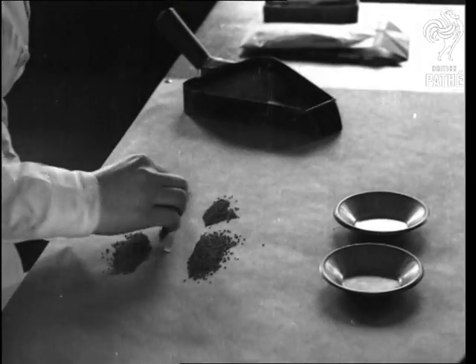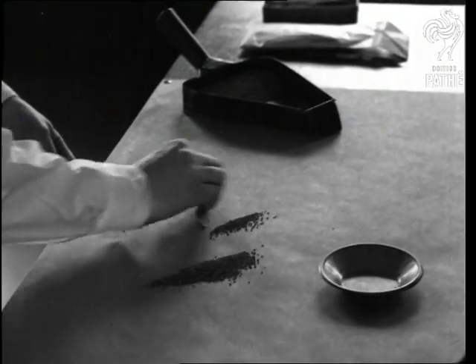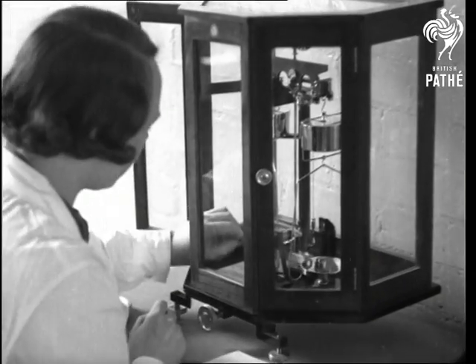A process of continuous halving of the bulk samples sent to the station gives the right quantity for analysis. Then it's weighed, and the weight depends on the size of the seed.